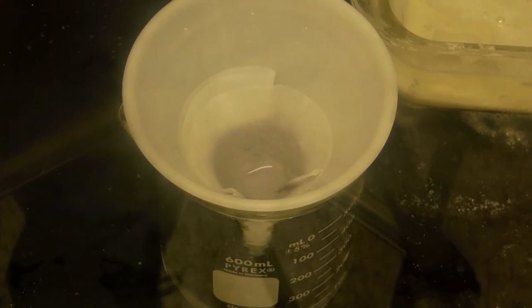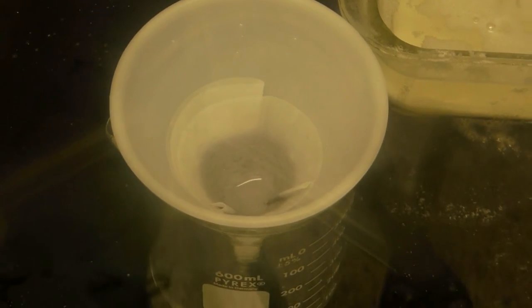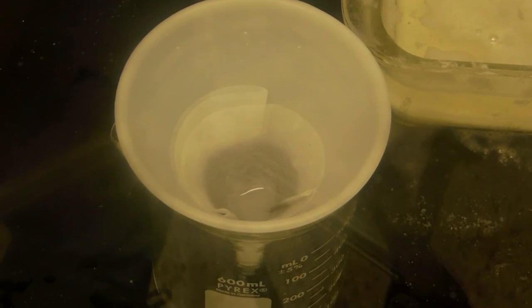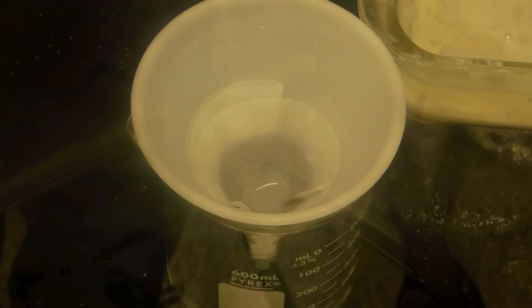So this is how the silver chloride looks now. It has an appearance similar to cottage cheese. I washed up the silver chloride numerous times in order to achieve a clean silver chloride product, and so now I'm able to move on to the next step.